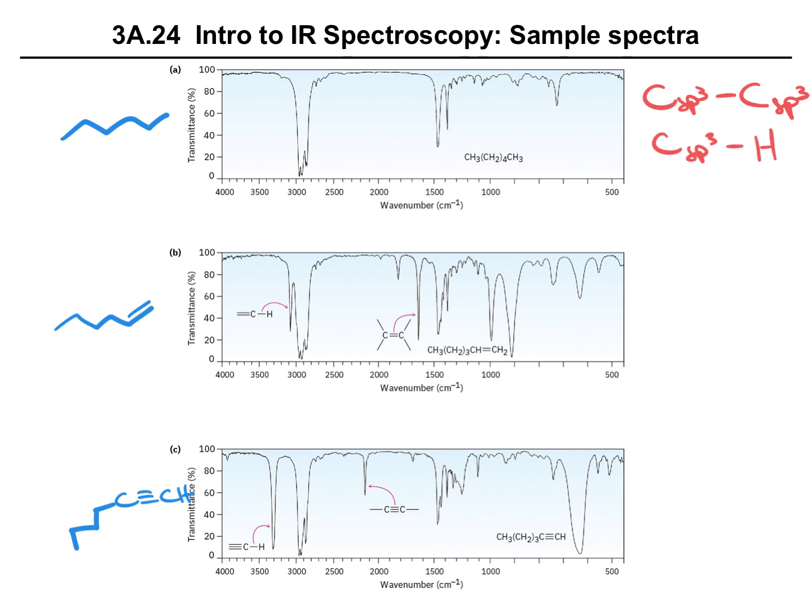Let's focus on, here's 1500. So to the left of that is the diagnostic region. And what we have here is a few peaks. When we mentioned zones, we said that this is where we're going to find bonds between hydrogen and some other atom. So this group of signals must be due to the Csp3 connected to the H. The carbon-carbon single bonds, in terms of zones, we said that that's going to be in here. We don't really see anything that's very clear, and so this is not going to be very useful.